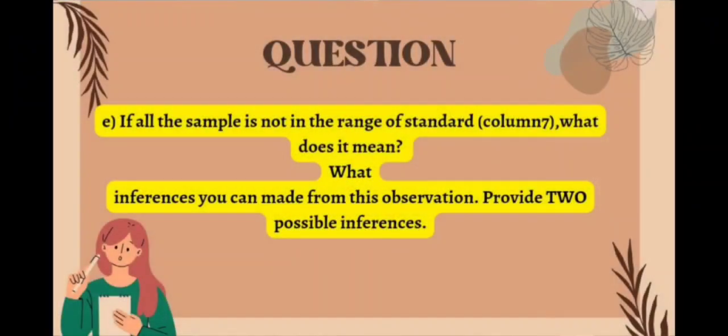So, what we can see from here is that degradation over time and/or improper storage might be responsible for this error. To address this, we can emphasize the importance of proper storage based on manufacturer recommendations and the use of freshly prepared standard solution to maintain the accuracy in the assay. So we move to the next question, which is E.